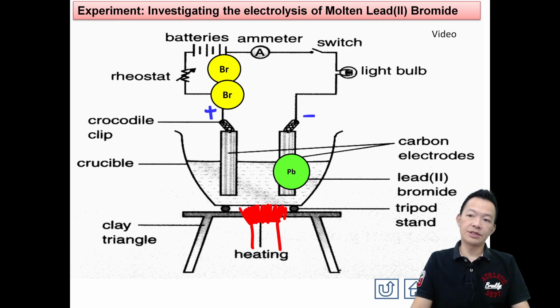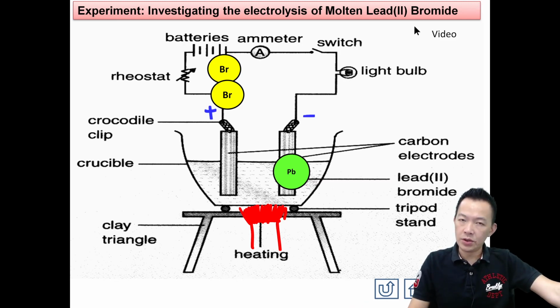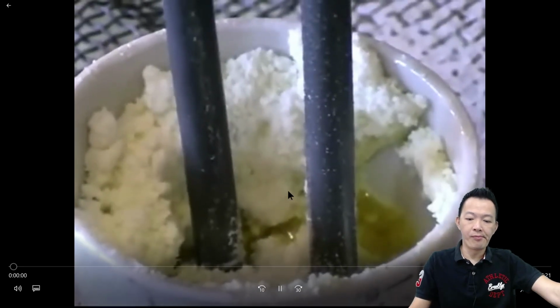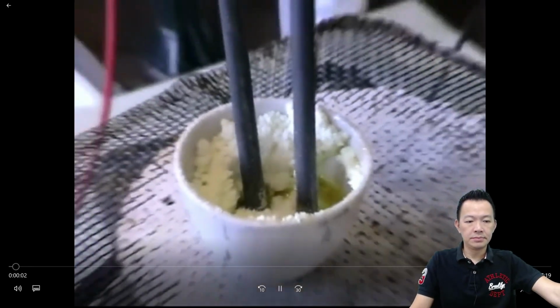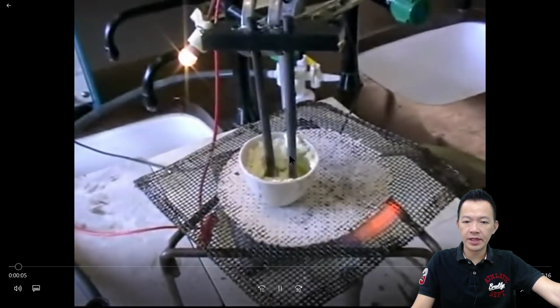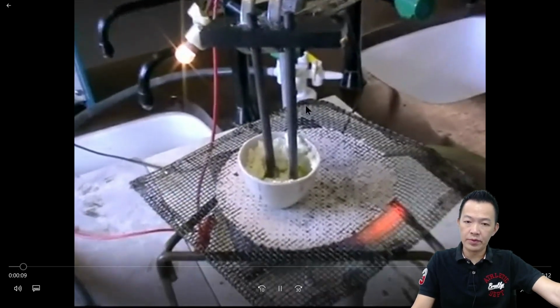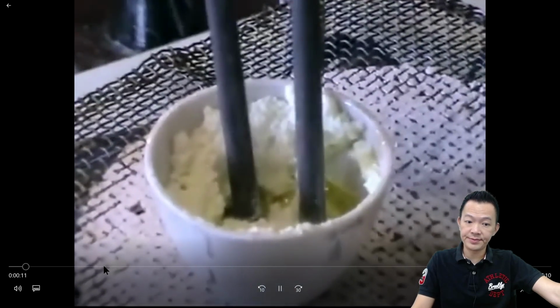So this is electrolysis 这就是它的电解法来的 Now we watch the video and you try to feel the experiment 感觉一下那个实验到底是怎样的 okay? So lead bromide is a white color powder. Heat the lead bromide 把它拿去烧一下 okay?